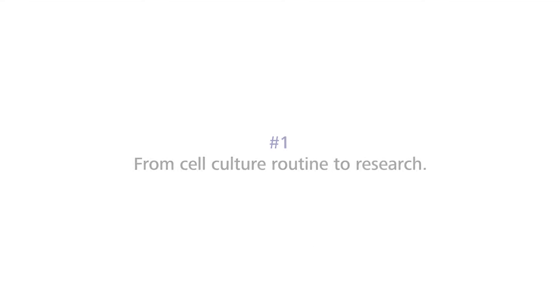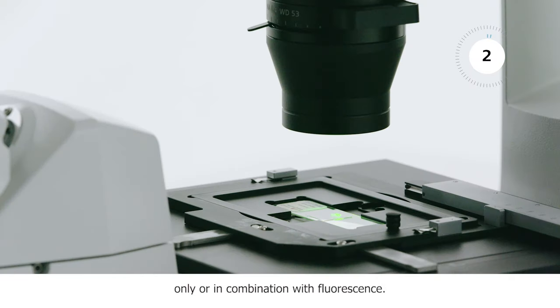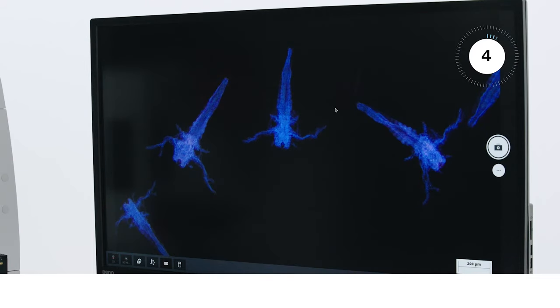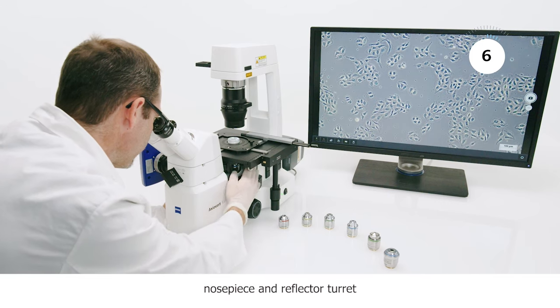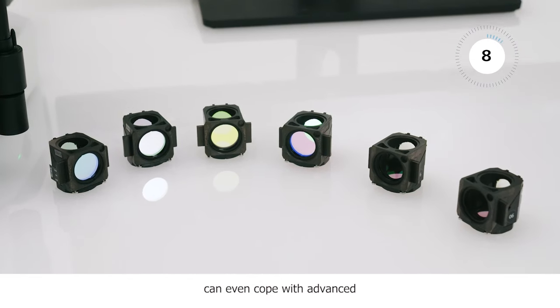Acquire outstanding images in transmitted light only or in combination with fluorescence. The six times encoded nosepiece and reflector turret can even cope with advanced research demands.